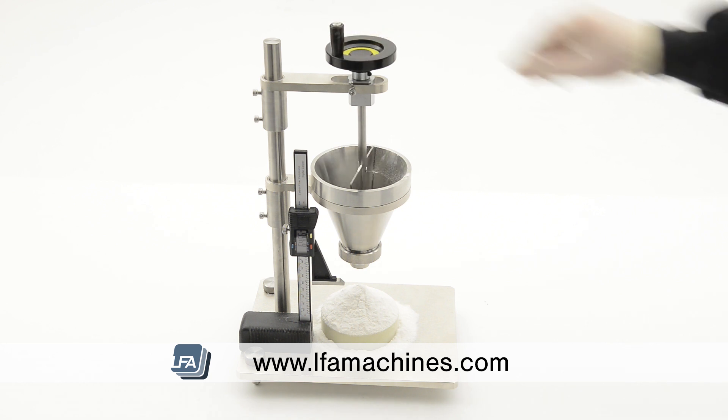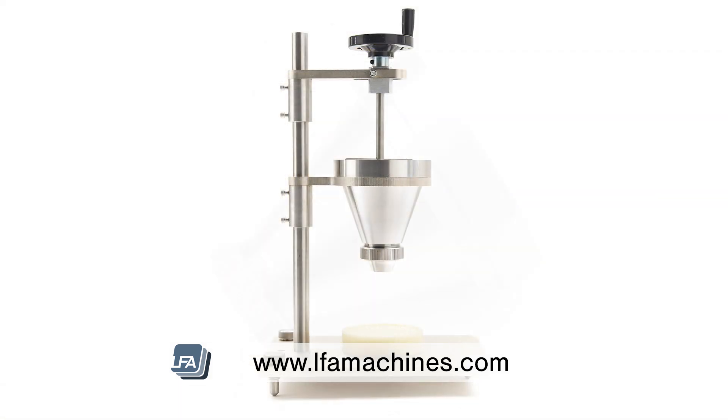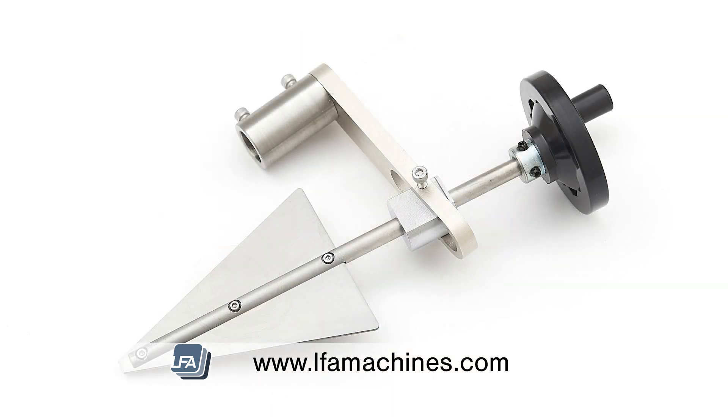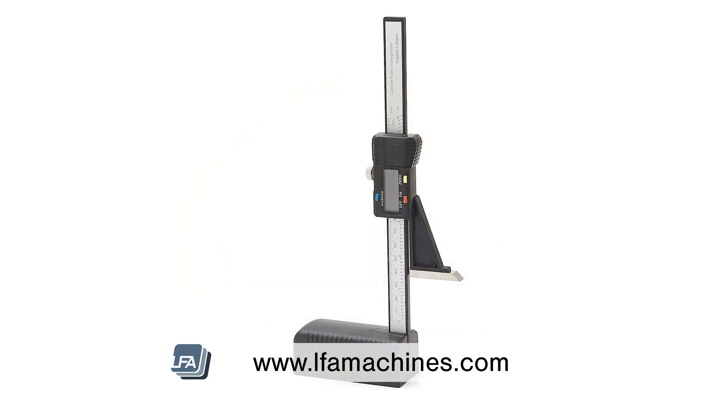The LFA ART1 comes with everything you need, such as a test stand, a powder flow funnel, three different sized nozzles, a stirrer, a test platform and a digital height gauge.